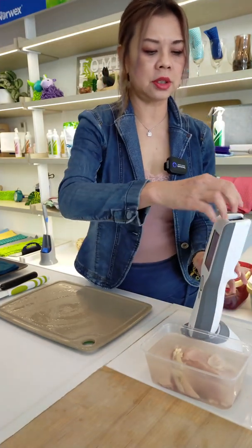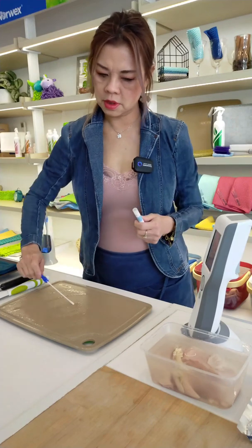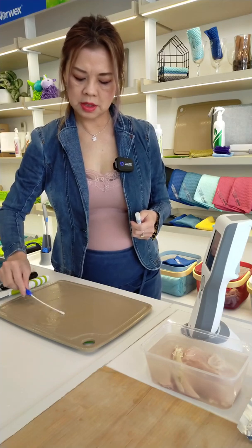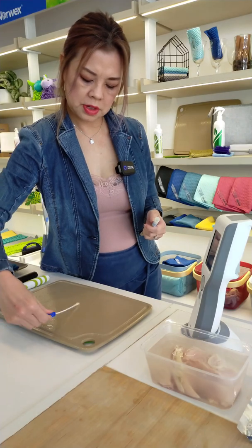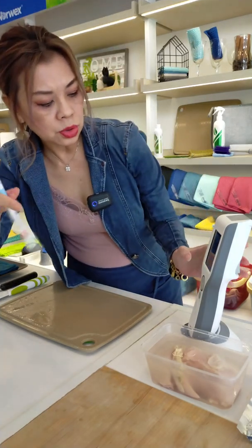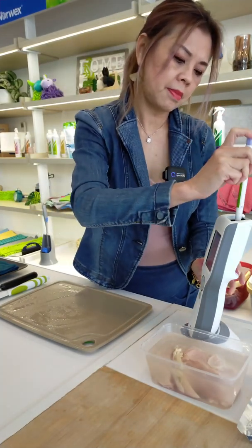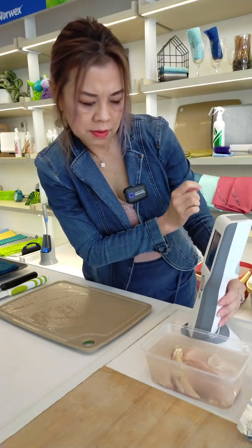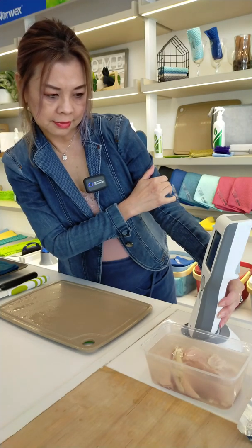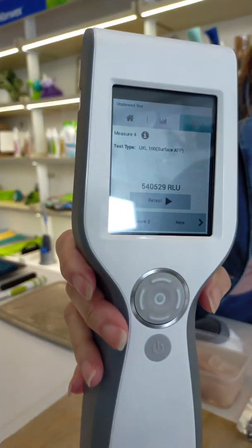The stainless steel had a six-digit reading. And now I'm going to test it on the cutting board. The cutting board result is 540,529 RLU, because it's an immediate fresh cut from the chicken.